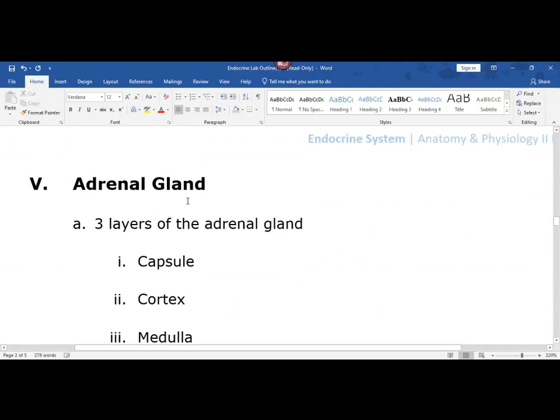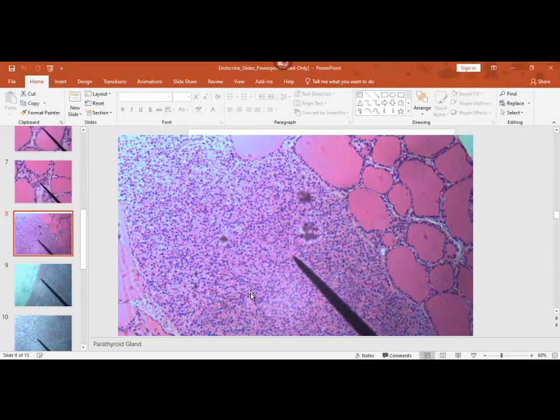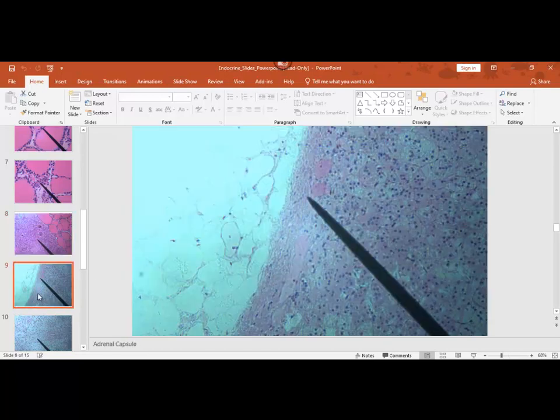The adrenal glands sit right on top of the kidneys. We actually have two of these. And adrenal glands are like a lot of organs or glands. They have regions. And this one has two regions and a capsule. By definition, what makes something an organ or a gland is that it has a capsule around it. So I'll show you this, and I have a couple of extra pictures I can show you as well for that. So we're going to go to the next one.